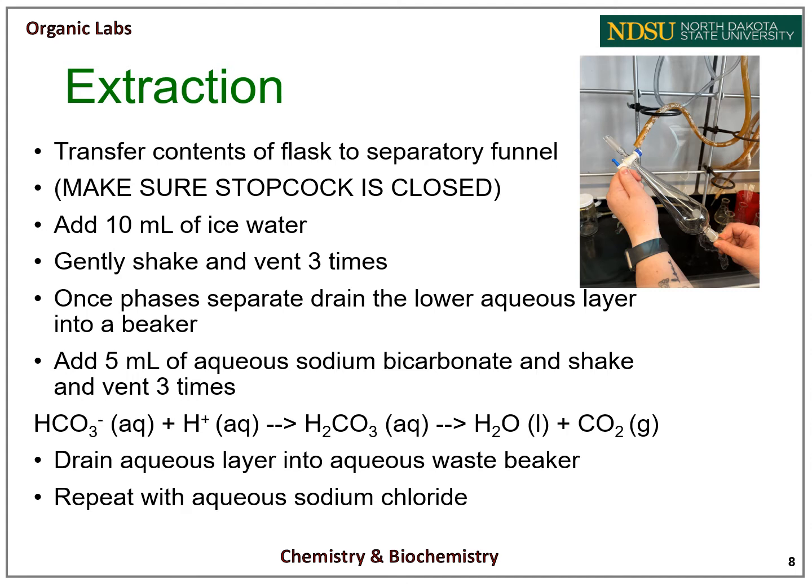Add 10 milliliters of ice water and place the lid on. You will then gently shake your separatory funnel briefly and then vent. When venting, do it as seen here, with your separatory funnel pointed up and angled, opening the stopcock slowly. This is going to relieve the pressure inside.